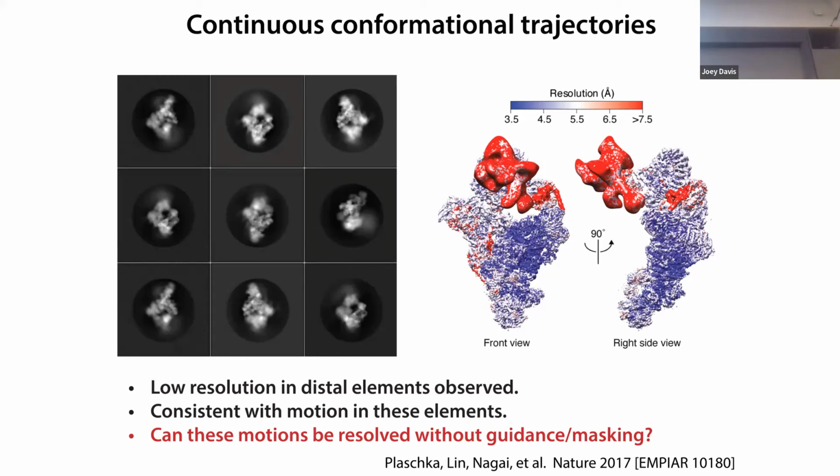Yeah, so one of the challenges is that you need to do two things for cryoEM. You need to figure out what angle you took the picture of the molecule from, which we call the pose, or projection angle. Then you need to figure out the underlying structure of the molecule. It turns out that for all these algorithms, they really need some domain that is rigid enough to do the alignments to get that initial pose. And then once you have the pose, you can start to see these. So things that are purely IDRs, nobody can touch.